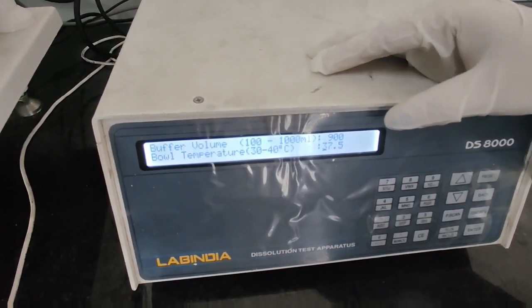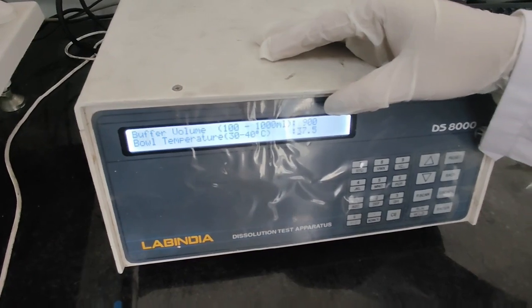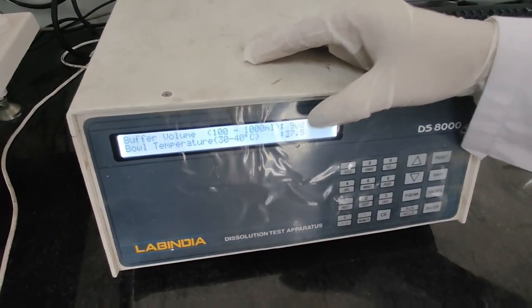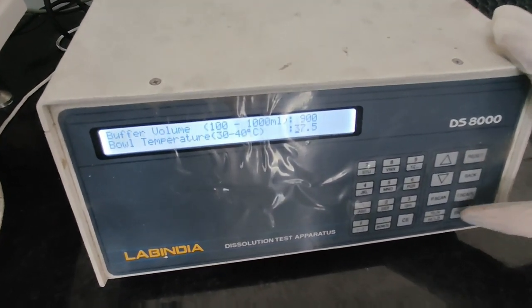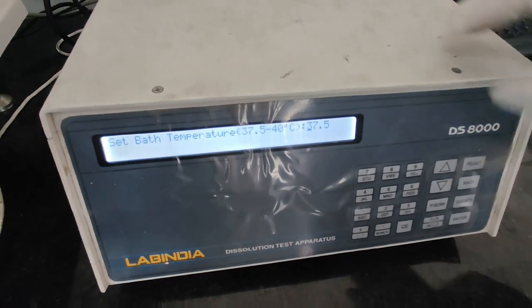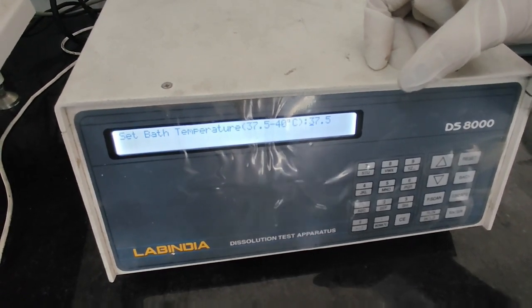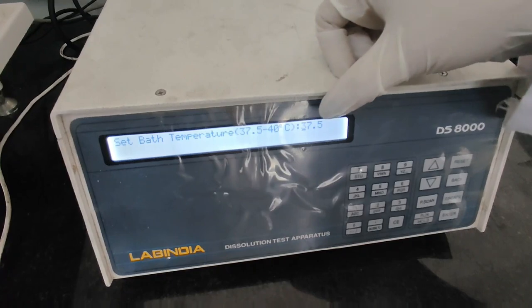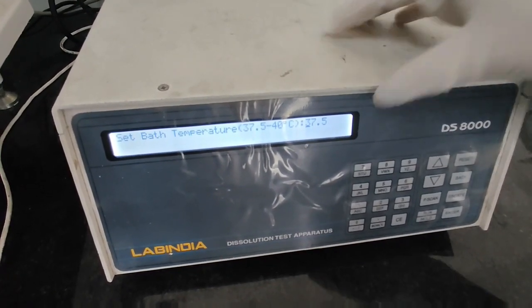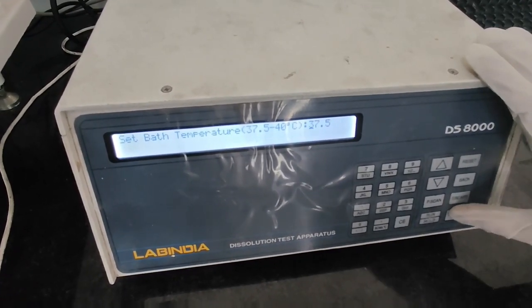Next is temperature. It is already 37.5 degrees Celsius. If you want to change it, we can change it from here. I will press enter. Then is bath temperature. The temperature that you want to set, you may enter here. This is already 37.5, so it is okay. I will press enter.